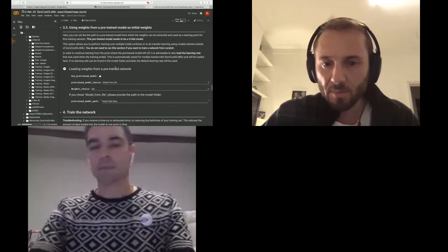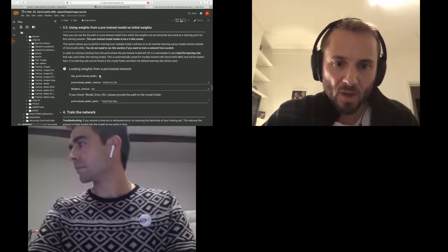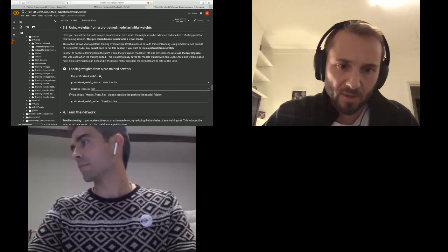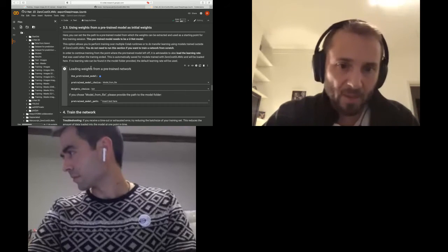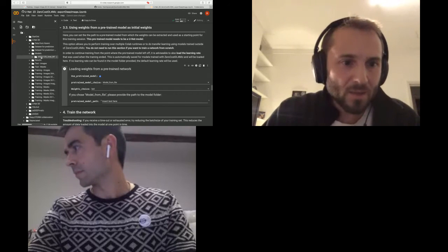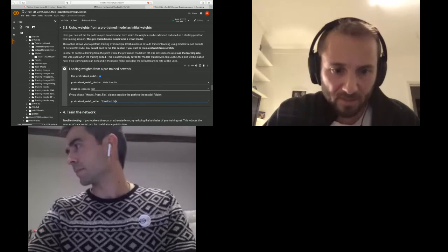We've got another thing that we can set up to give the network a head start. We can tell the network to not get initialized completely randomly, but to start from a pre-trained network, right? I've already got a network that I trained yesterday that I'm going to give it.